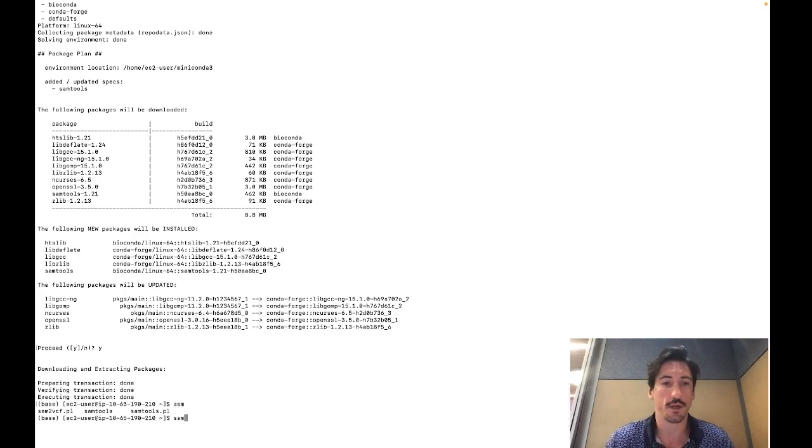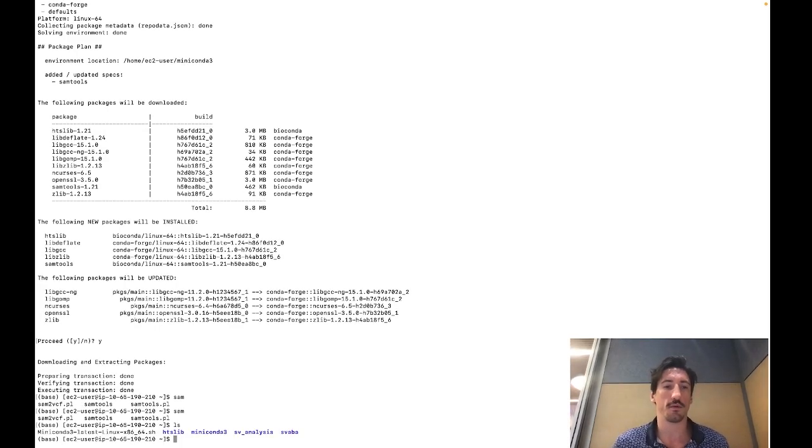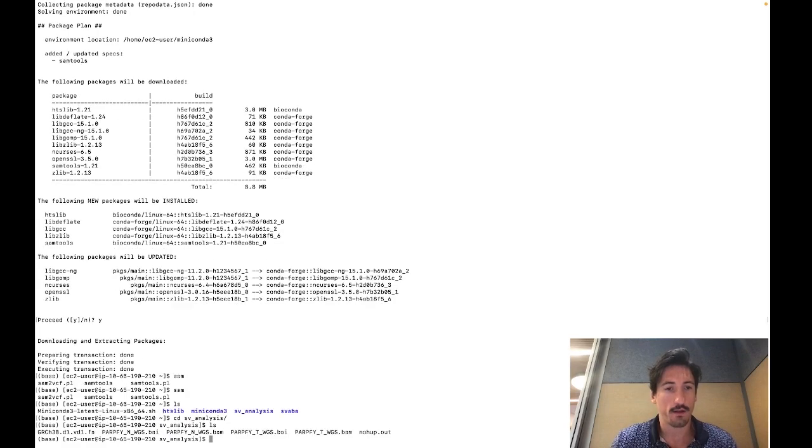All right, and we just make sure samtools is indeed in our path. So now we've installed samtools and BWA. Next we're going to have to index the FASTA file that we just downloaded. The commands that we'll be using, first we'll do samtools since it's quicker, faidx. We just select our FASTA file.